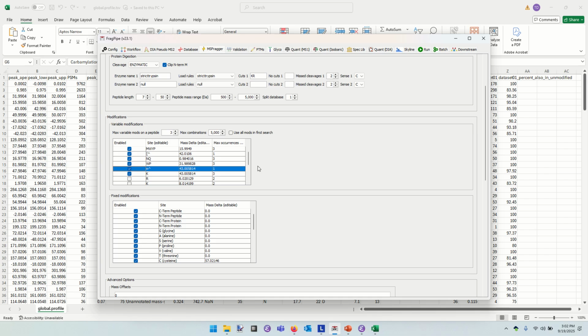And the next one is unannotated. We've no idea what chemistry would cause phenylalanine to gain 49. So we can add it, but honestly, I don't care that much about something I can't explain. I'm not going to be investing in a bunch of biochemistry to figure out what happened in those peptides. So I propose this is a good place to stop. And if you want to add another modification to yours, you go for it. Let me know if it finishes, okay? We'll give this a try.